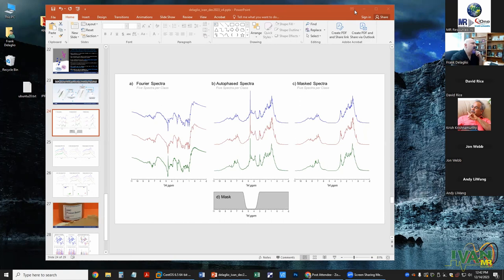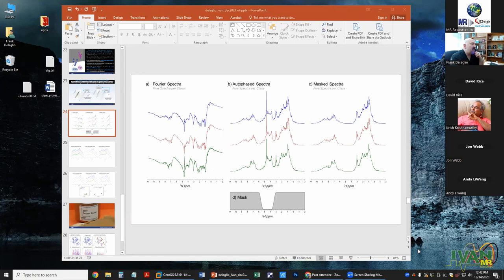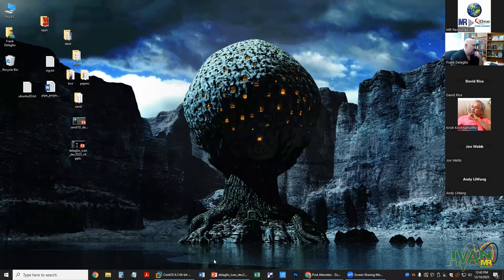This is part of an exercise where we're trying to measure the degree of similarity in the spectra between related molecules. For example, in our case, we're interested in things like whether one antibody drug is structurally equivalent to another antibody drug. And we do this by spectral comparisons. So that's the motivation of this particular example. But thank you. Good question.